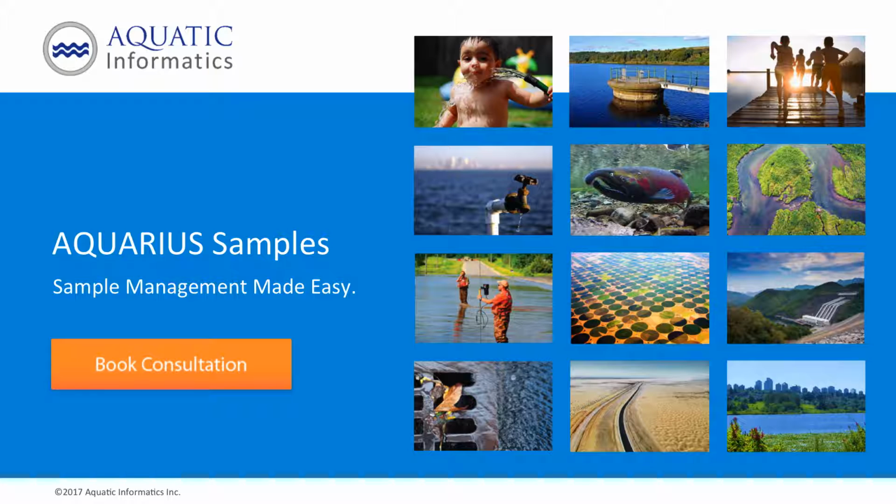That concludes our demonstration of how to import and validate lab results with AQUARIUS Samples to save time and improve sample data quality.